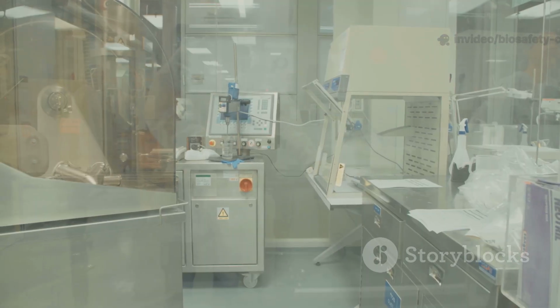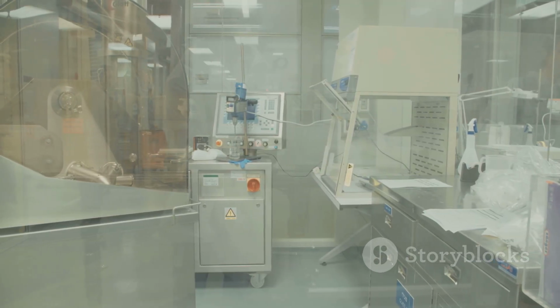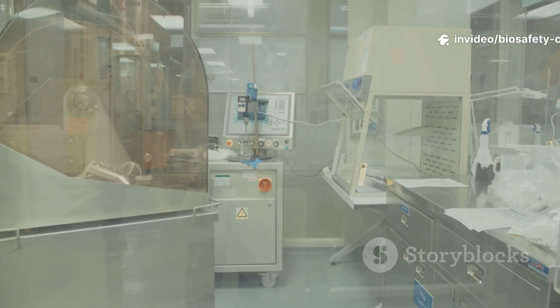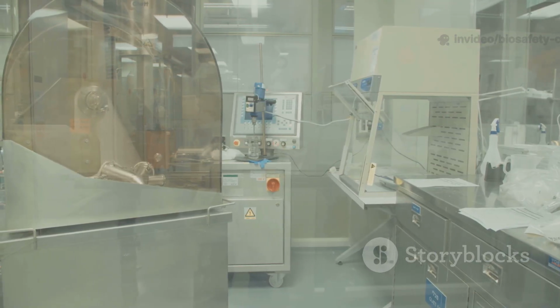Class 2 A2 cabinets are similar, but with a higher inflow velocity, 100 feet per minute, and negative pressure plenums for added safety. About 70% of air is recirculated, 30% is exhausted, and they're suitable for trace amounts of chemicals.